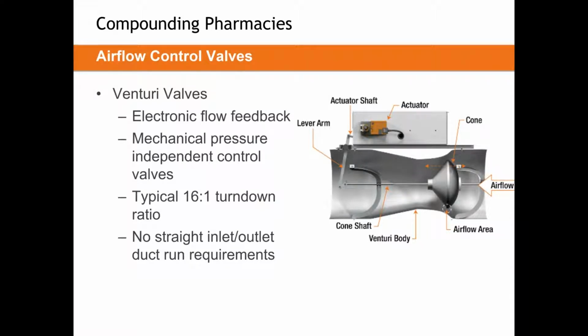So it's either operating or it's not operating. That would be the most cost-effective way to get the two set points you truly need on a biological safety cabinet, and that two-position Venturi valve would be my number 1 recommendation for these cabinets. We have rarely seen them as full VAV. When we see that, they are typically operating in some form of two-position as well.